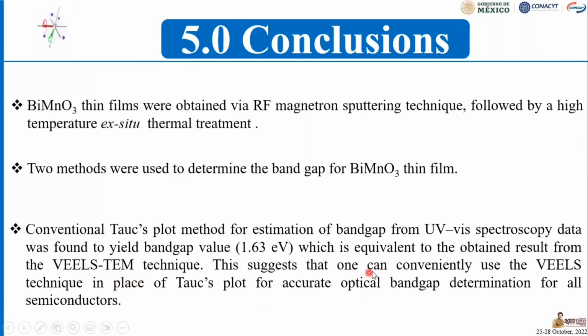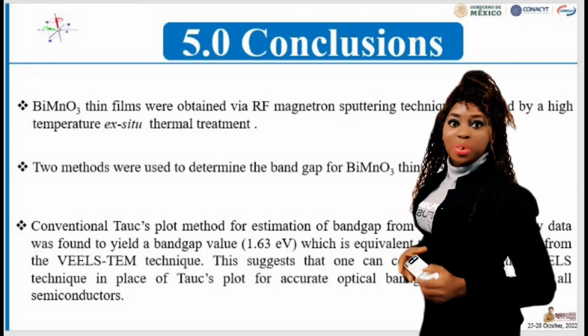This suggests that one can conveniently use the VEELS technique in place of the Tauc plot for accurate optical bandgap determination for all semiconductors. Thank you for your time.